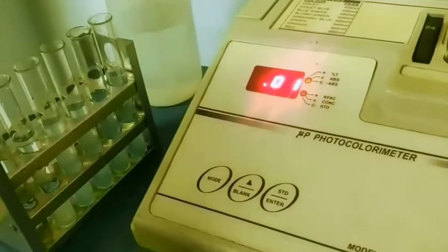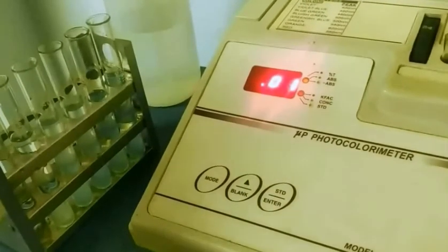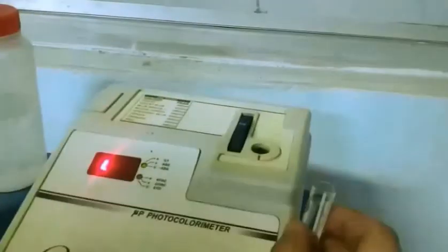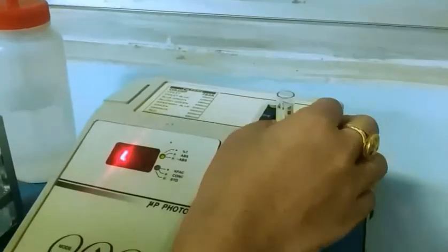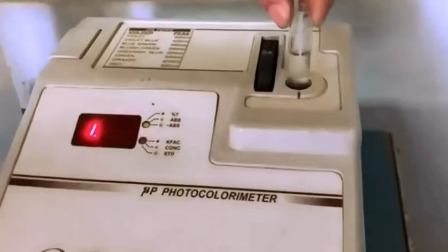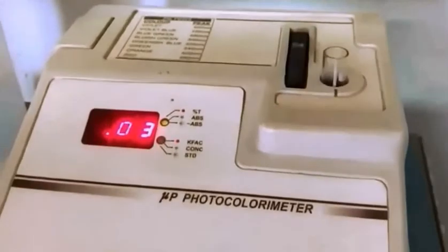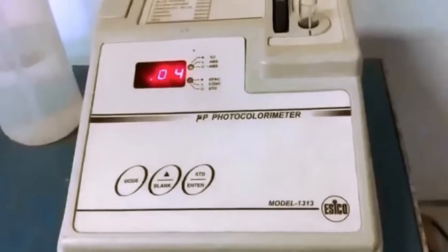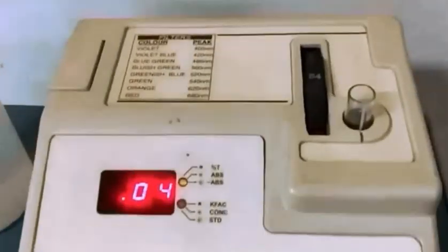For the first test tube the optical density is 0.01, and then for the second test tube, that is for 0.2% copper sulfate solution, the optical density is 0.02, and then for the third test tube 0.03, and for the fourth test tube 0.04, and for the fifth.